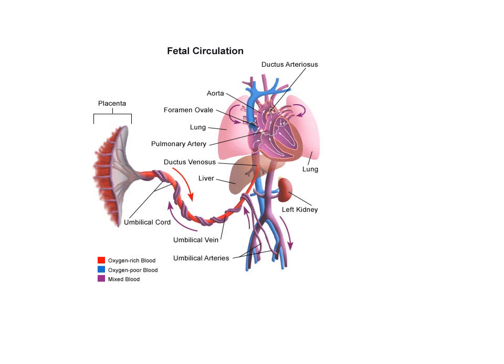Remember, when you're a fetus, you're living off of your placenta. That's the interface of the fetus's vascular system with mom's, and that's where all the gas exchange, waste exchange is happening. So communication through the umbilical cord and through the vasculature associated with it, the umbilical vein, which is the big one coming in with the good stuff, and the umbilical arteries, which are the smaller ones wrapped around it, carrying the deoxygenated blood back to the placenta to receive its oxygen. So please be aware of that system too.